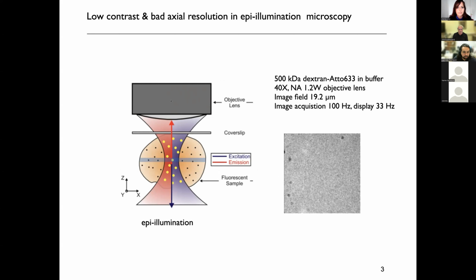Okay, so in normal fluorescence microscopy, we illuminate an extended sample with epi-illumination, usually from the top or from the bottom, but we illuminate the complete sample. Although usually, we are only interested in the fluorescence that is occurring in the focal plane. But the fact that the illumination passes throughout the sample seriously deteriorates the contrast and the resolution.